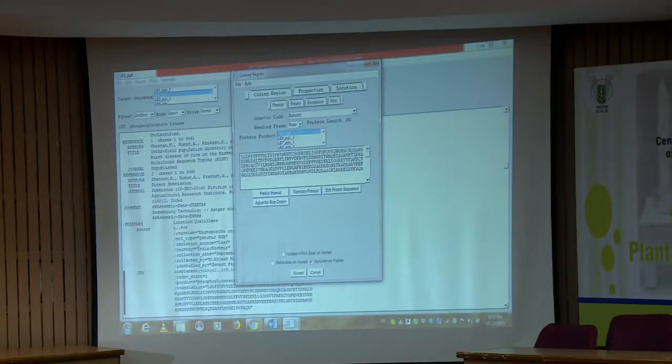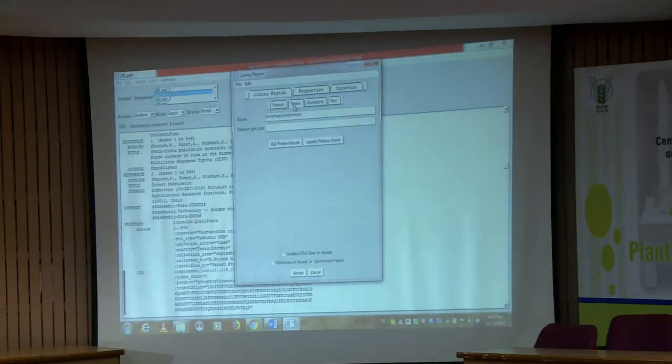You can select this region, it will show you the name of the protein you have entered. You started with PGK only, now you have to mention what that protein was, so that all ready-made information is available for the second person who is referring to your work. The same thing, if we need any information, we just go to NCBI, search everything, and we get all the information. That is the author or the person who did that work, who entered all the information.